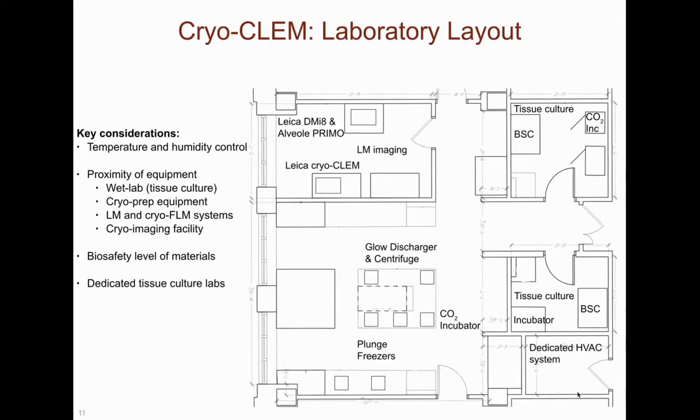Here in this architectural drawing, we illustrate the layout of our 900 square foot biosafety level 2 certified tissue culture, CLEM imaging, and cryo-EM preparative laboratory. The entire laboratory is rated for BSL-1 and BSL-2 work. This includes the appropriate safeguards for room access, airflow and circulation, environmental safety controls, and PPE and training for personnel.